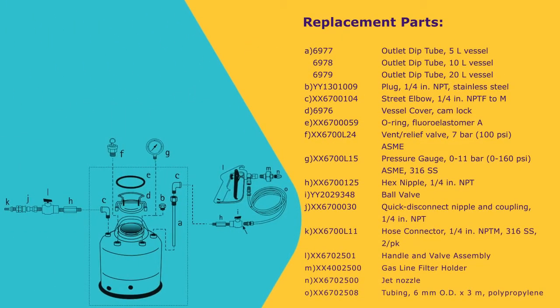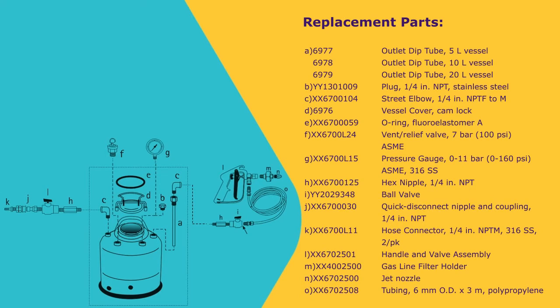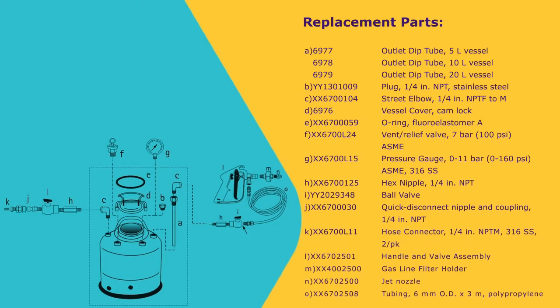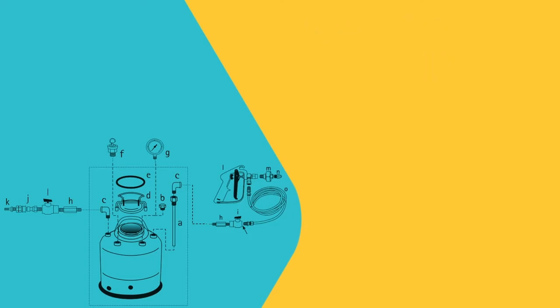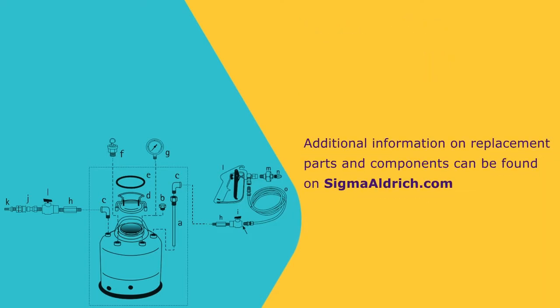In this video, we have labeled the components of the pressure vessel filter jet setup for quick reference based on the table below. Additional information on replacement parts and components can be found on milliporesigma.com.